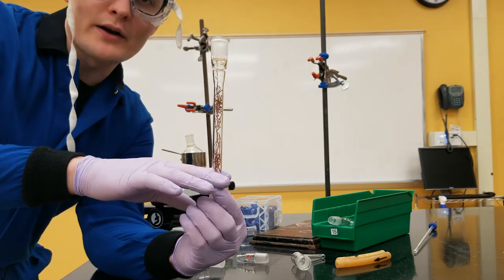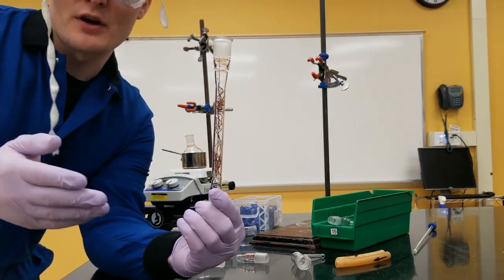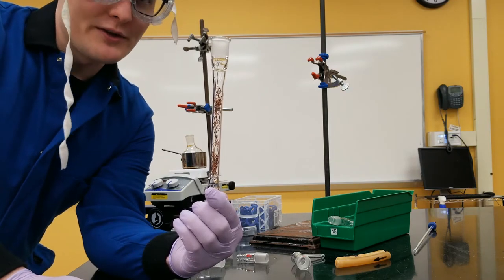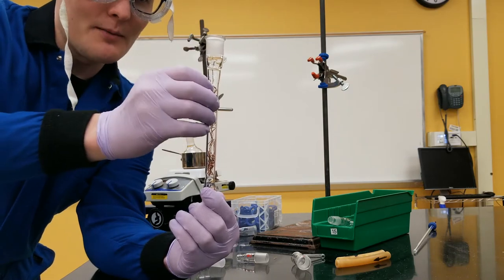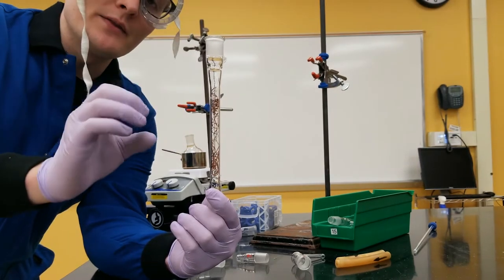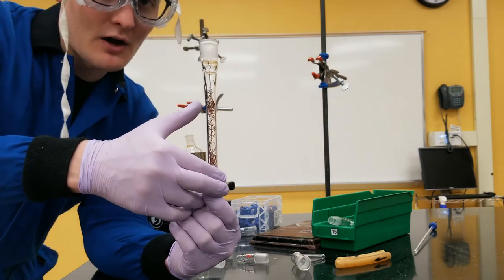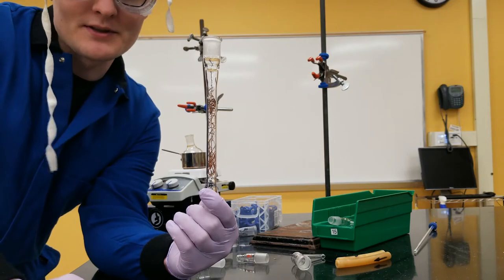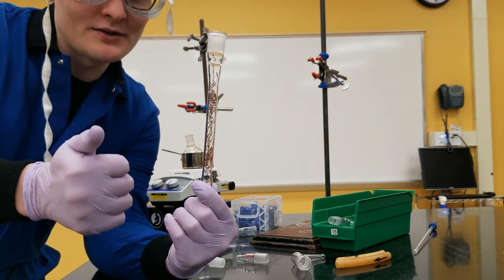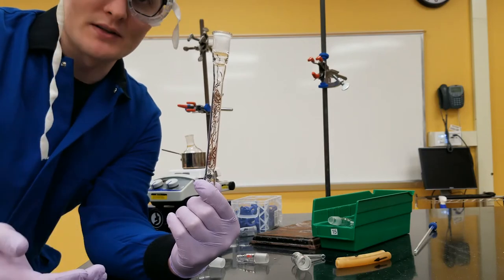This whole copper wire here has to heat up to the boiling point of the solvent passing through before a solvent is allowed to reach the top of this piece of glass. And what that means is your lowest boiling point solvent is going to heat up this coil of wire up to its boiling point, and then it's going to be allowed to pass. And then there's going to be a period of time where your next highest boiling point solvent is going to have to heat up this copper before it's allowed to pass and get up to the top of this glassware. So this copper buys you time between when the first lowest boiling solvent escapes and when the second does. That allows for a better separation of your solvents, and thus you get a better distillation.